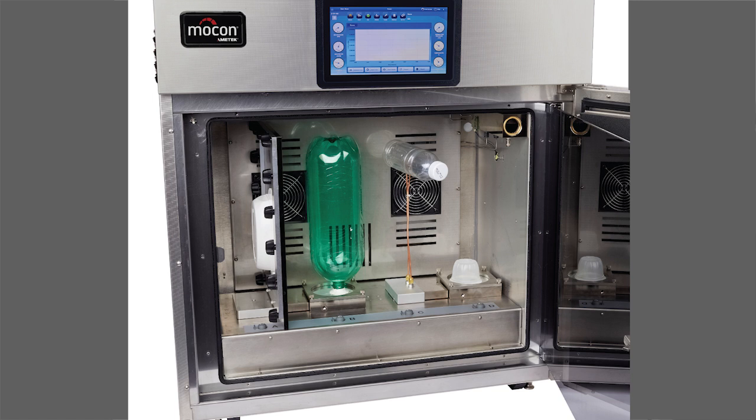But the permeation test, if you look at the bottle by itself, they usually have very tight tolerances between replicates, within 5% of each other, which is really nice. When you put a closure on it, though, that's a wild card. Whether that closure is a lidding to a tray, a lidding to a fruit cup, or a closure that's screwed on, you now can get ingress through permeating through the closure itself, but also maybe through the seals and the seams and the like.